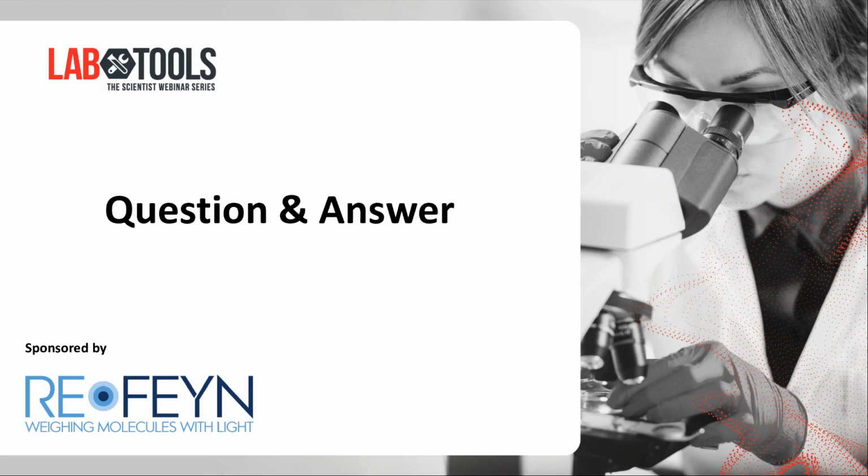Thank you. Is it possible to distinguish subunit assembly events that occur on the membrane versus those occurring in solution? Yeah, that's a good question. It depends on your system, really, what is more likely to happen. For example, in our case, the MIN system, we think that most of the events where subunits attached to complexes on the membrane came from solution.